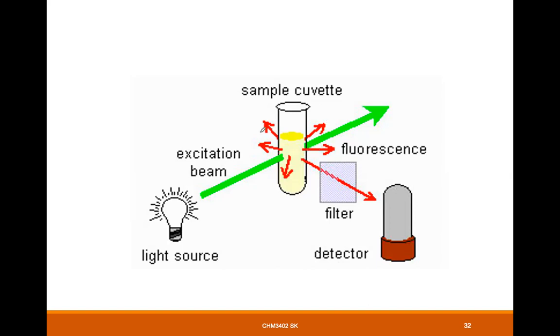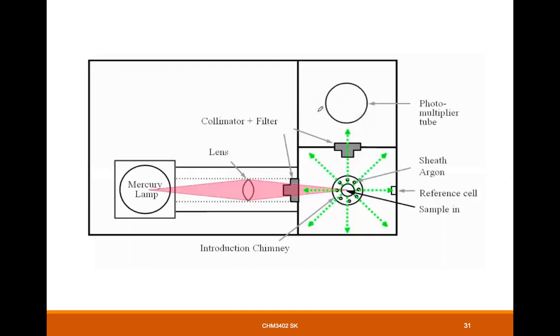There are so many other emissions that can happen, but for fluorescence it is much more selective and much more sensitive. The filtration of whatever is being produced is much more selective. That's why by using fluorescence you have a reduced amount of interference. That's the beauty of using fluorescence, but it's hard to get fluorescent properties.